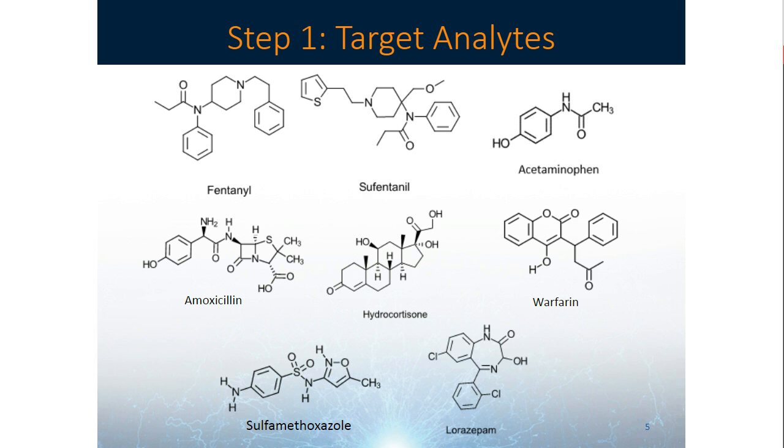So you notice these compounds have different functional groups. They'll have different pKa's, different solubilities, and they lend themselves to be analyzed basically with different conditions. So if you know the target analytes that you're trying to separate, that's really a good place to start for your method development.